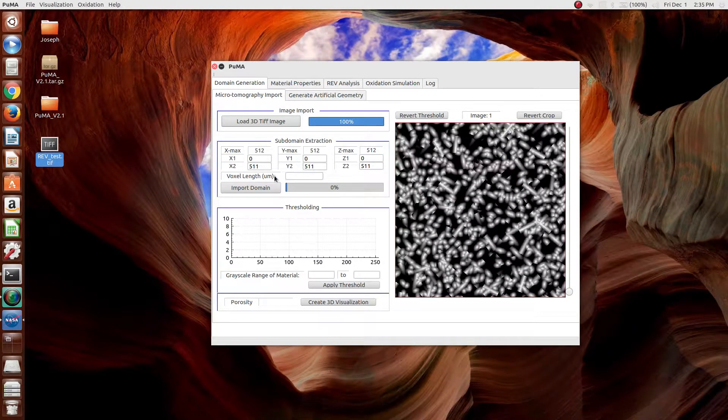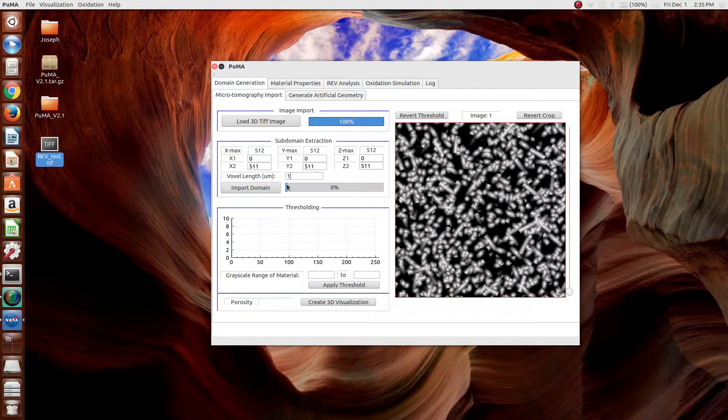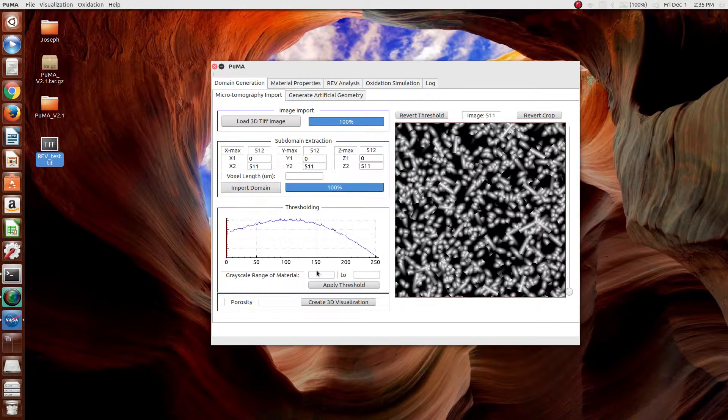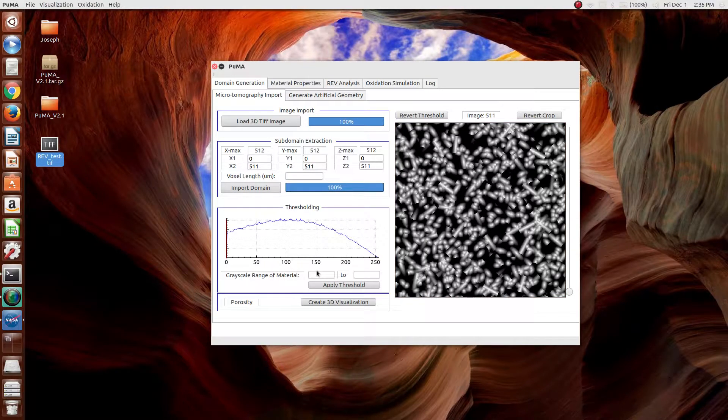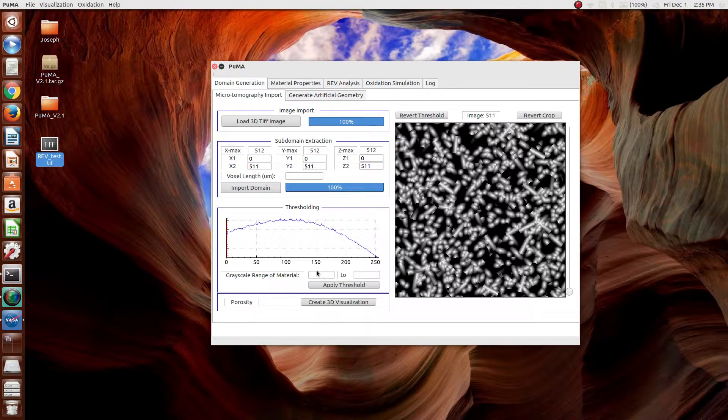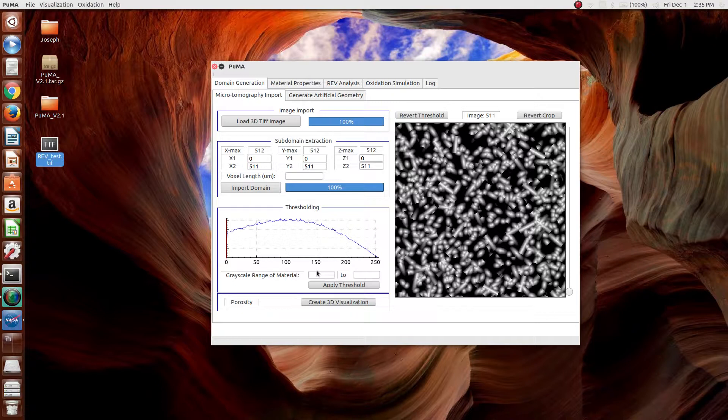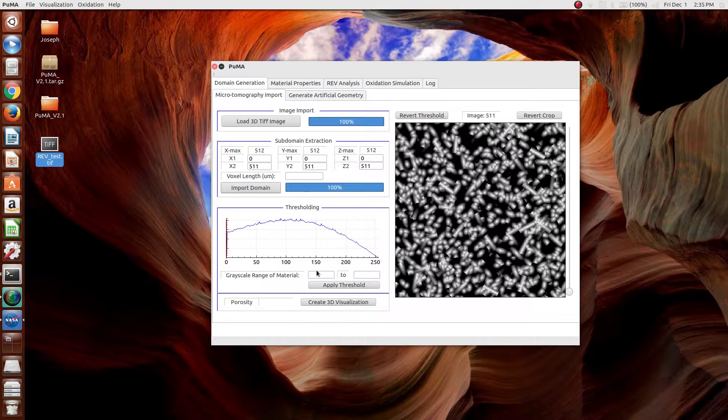Now, what representative elementary volume analysis is, is a way to determine at what size for any given property that you want to compute, you can be reasonably sure that the output you're getting is representative of the overall material. So, the way we define that in PUMA is where if you take the same property calculation at multiple places within your domain, the standard deviation of the value falls to below a certain threshold that's usually taken to be 1 or 2%.